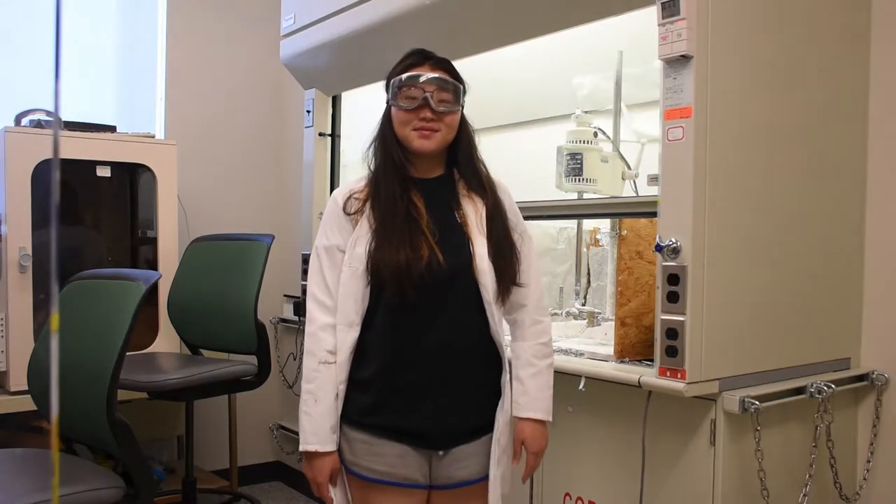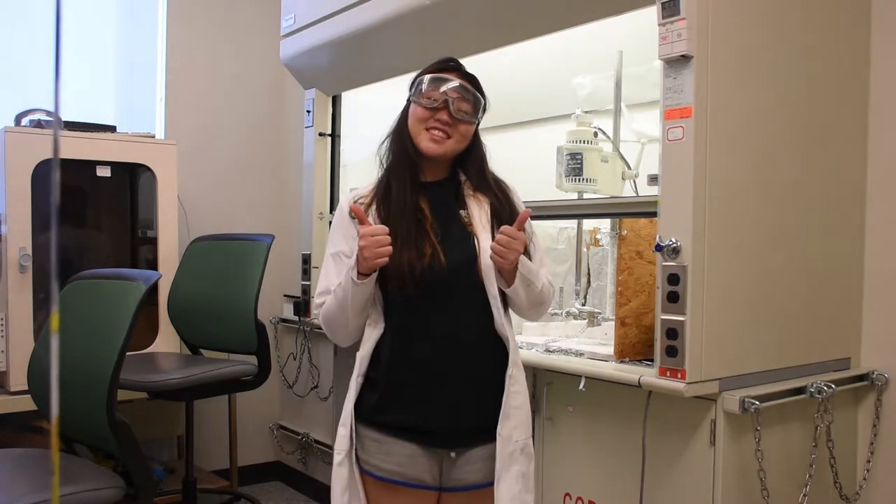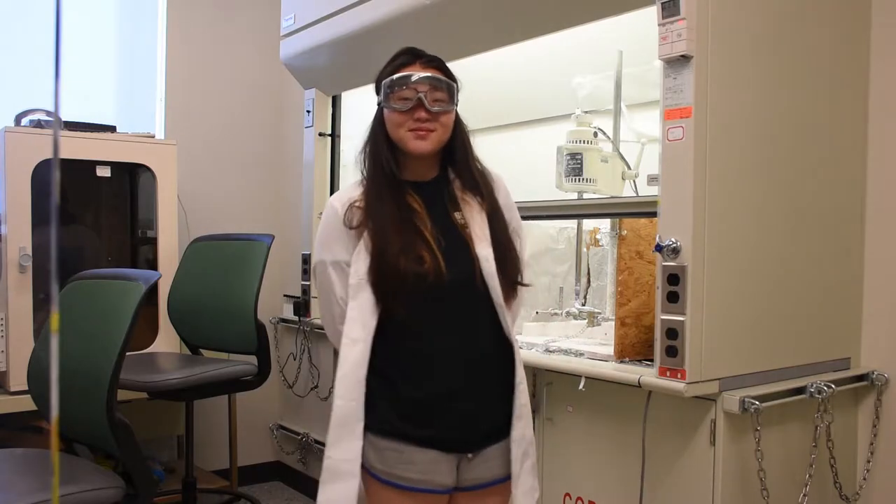Hello, this is Courtney. She's a biology major from the class of 2017. Today, she will show you how to clean up acid or base spills.